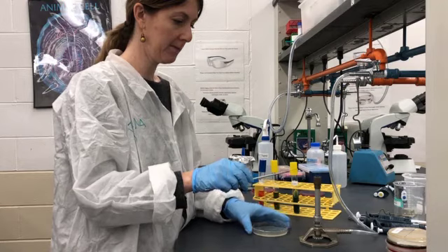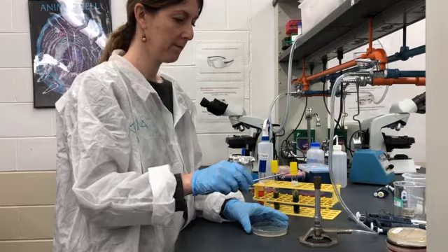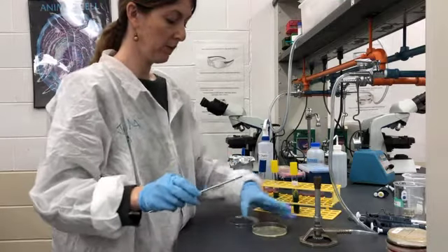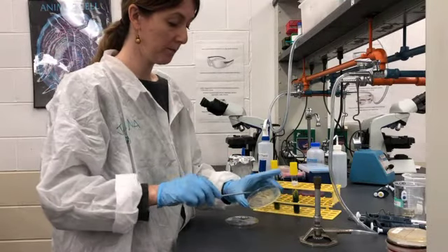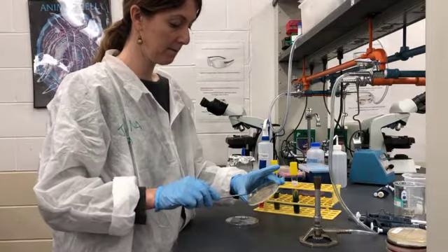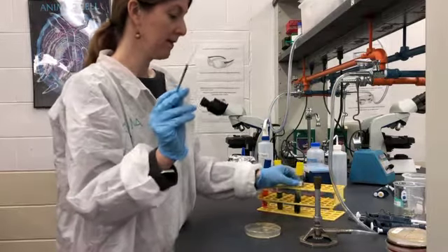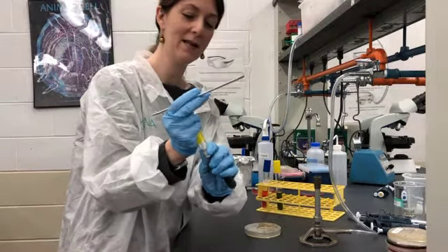Sterilize my loop. I'm going to cool my loop. I'm going to collect the colony. I'm going to use my pinky to take off the lid.